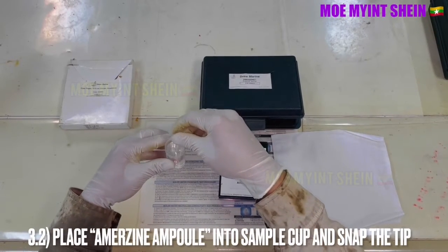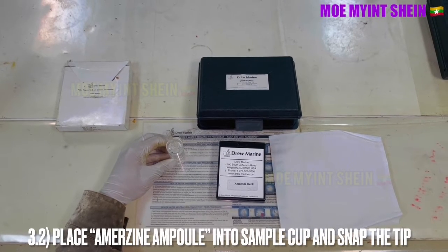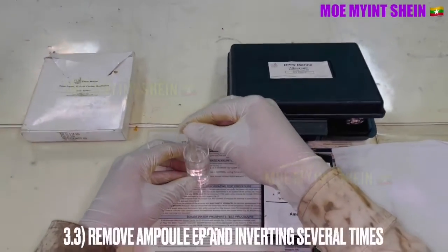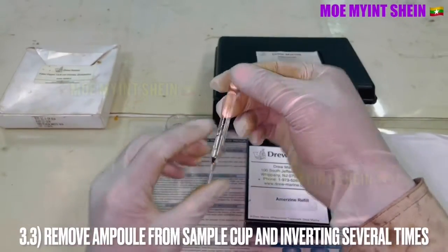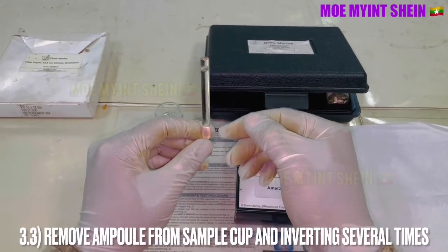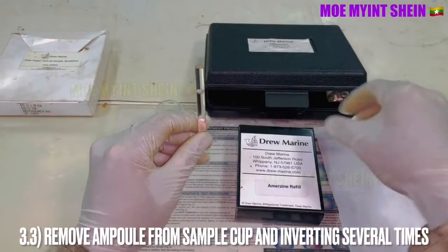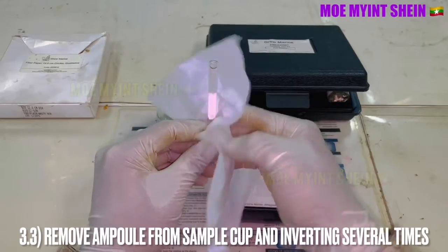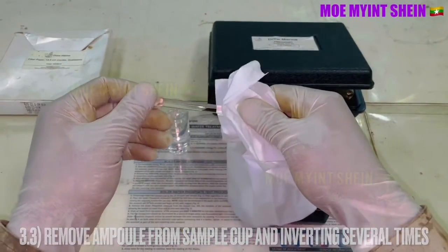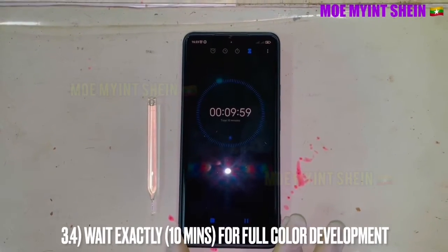Place the ampoule into the sample water and snap the tip. Remove the ampoule from the sample water and invert it several times. Wait 10 minutes for full color development.